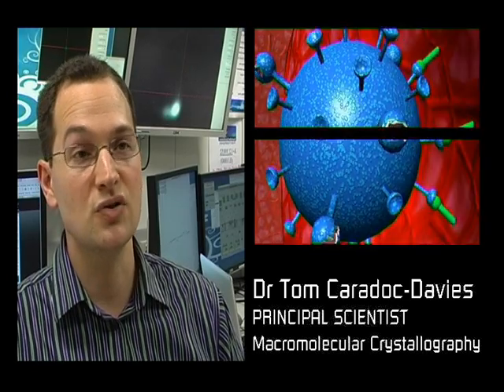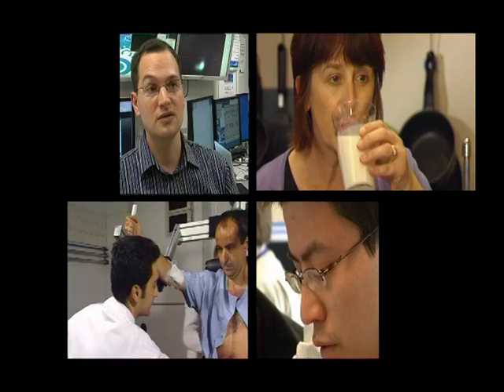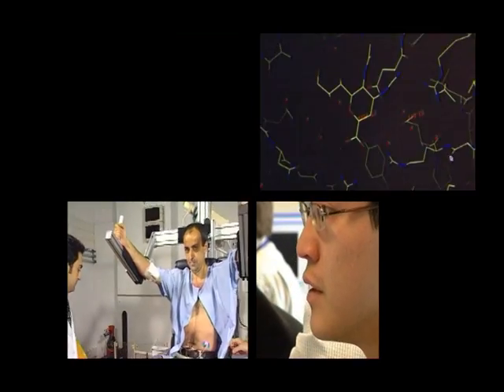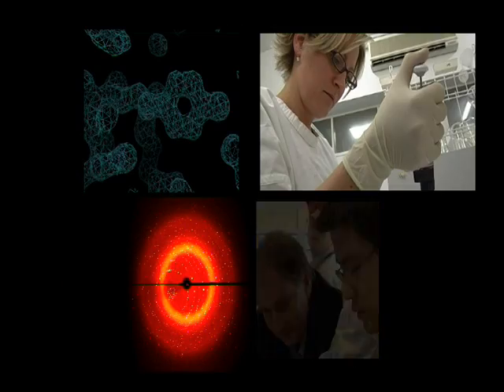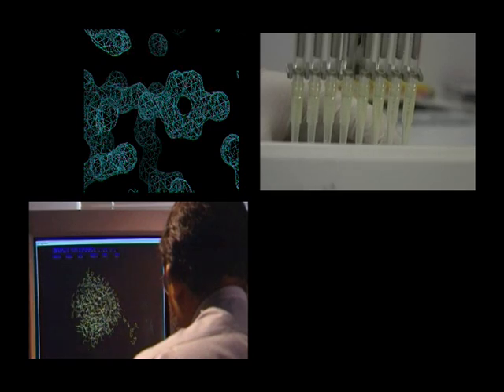So proteins are used to form the structures and skeletons of cells. Proteins also carry out all of the reactions in living things to allow them to function. A second protein crystallography beamline has now been built here at the Australian Synchrotron, known as the MX2.